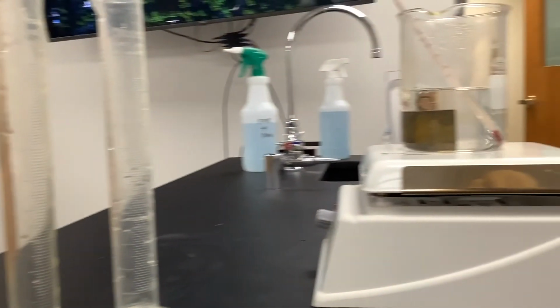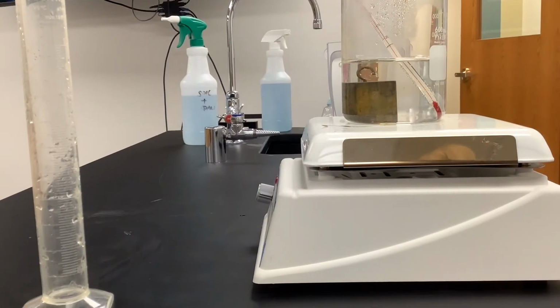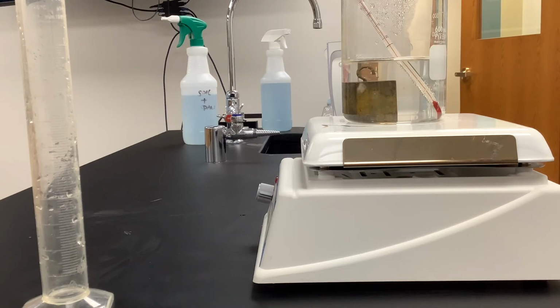Next, we need to take a look at the metal cube. We need the initial temperature of the metal cube. That is not something we can measure directly, though. We can't stick a thermometer right into the middle of that metal cube. But it has been sitting in this boiling water, and we know that heat transfer would happen between the water and the cube until they reach an equilibrium, until they are the same temperature.